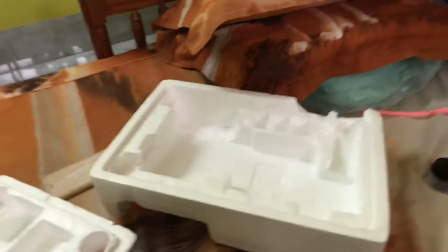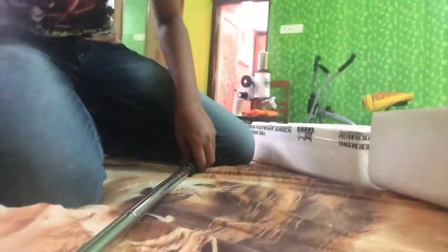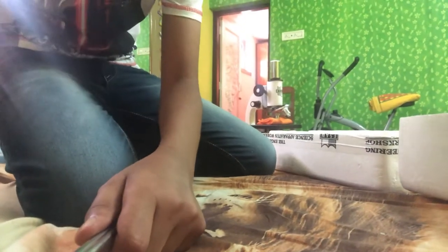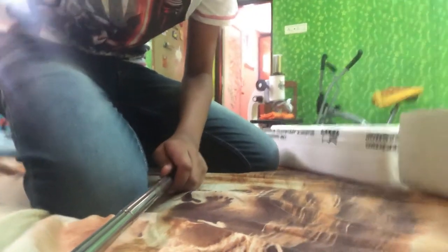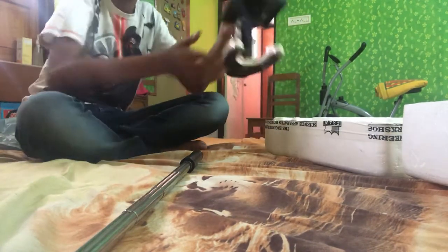And now, the main part. Let's start with the microscope, shall we? Now, the company of microscope is ESAW. And that's all. I think that's all. And now — the microscope.